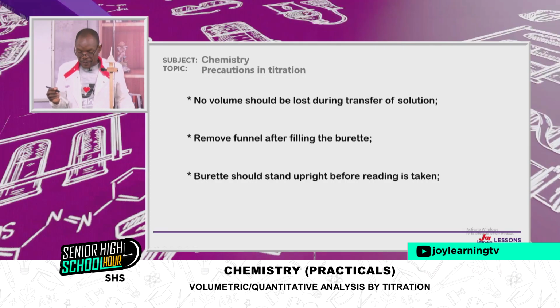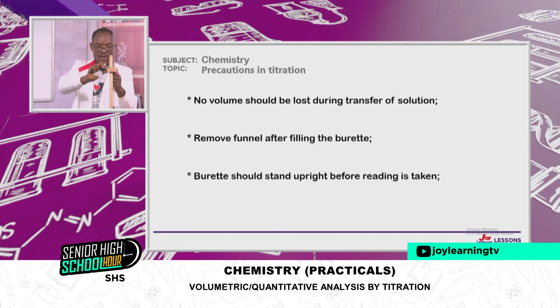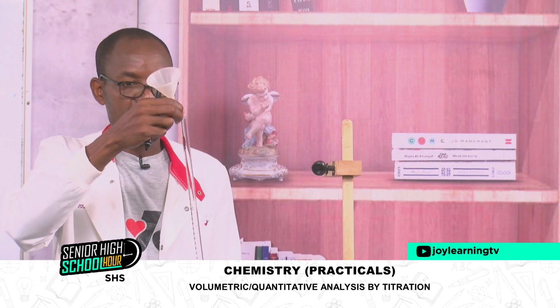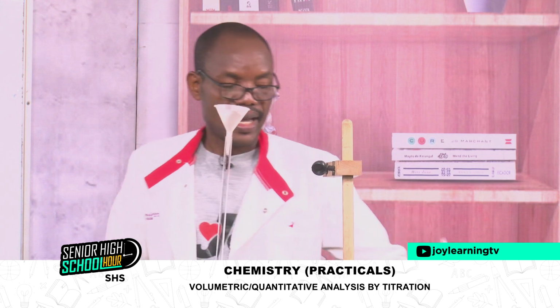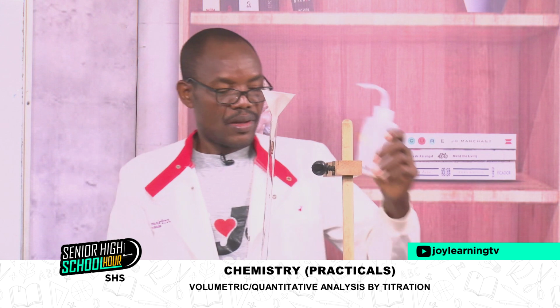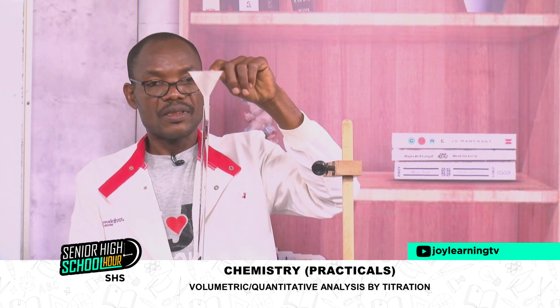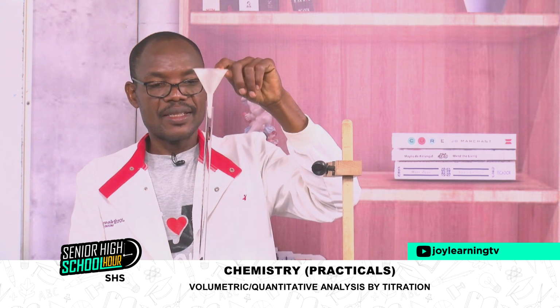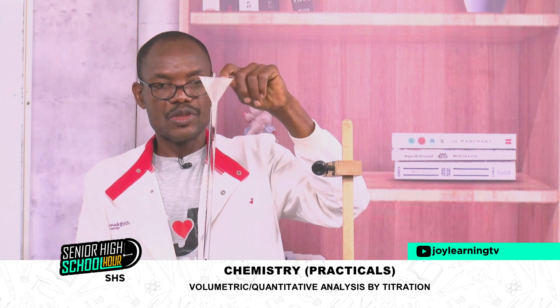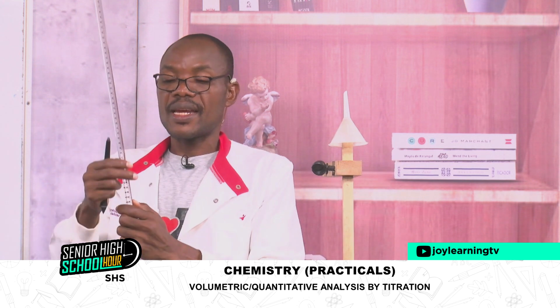Remove funnel after filling the burette. So this is my funnel, and I'm filling the burette like that. After filling, when you shake it, you see that there are some drops of solution coming out. So you do that, you remove it before you take any reading.